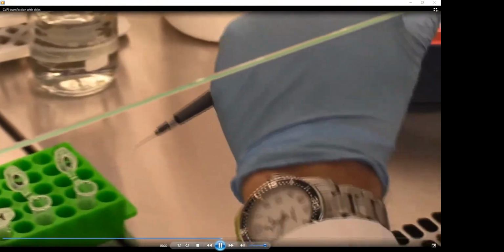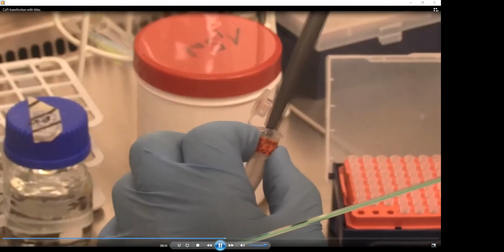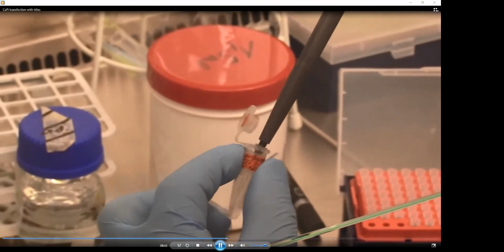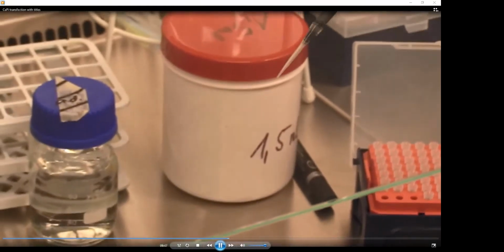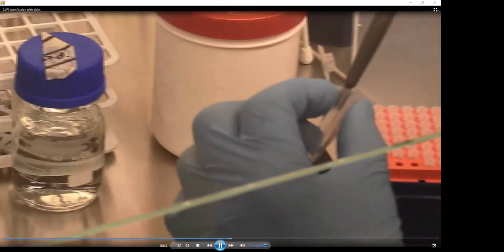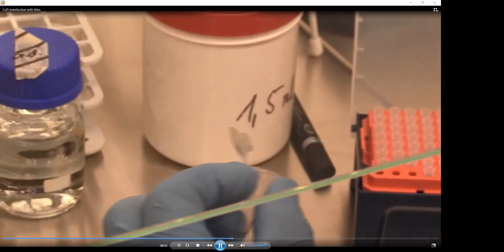So this is the plasmid vector containing T7. You have to add 1 microliter. Mix it first. Important is that all these stock solutions are properly labeled. So you see there the concentration of the stock solution, which is 1 microgram per microliter. You add it to the mixture where you have already your reporter.